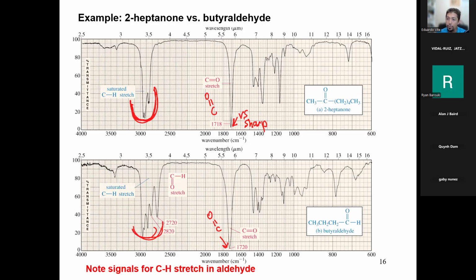They are always present because it is an organic molecule. Every organic molecule has carbon-hydrogen bonds by definition. So these are always present. Look at the bottom, they're present. They look a little different, right? But they're present. So how do you tell the difference between a ketone carbonyl and an aldehyde carbonyl?